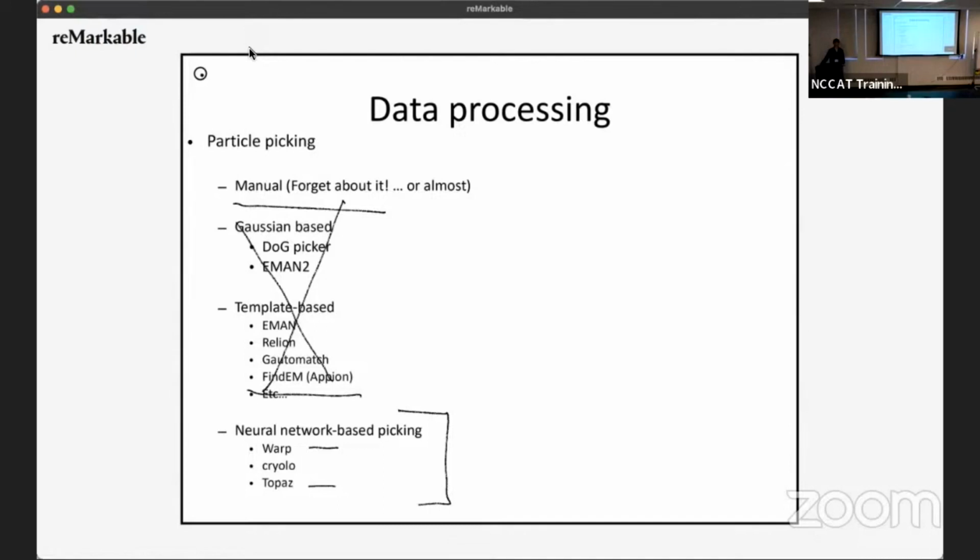Yeah. The problem that I have is that most of these pickers expect basically a circle or a blob, but I have basically a stick. So I have to do manual picking because none of the blob pickers are working for me, and use that to train the tools. Is there a way to get around the manual picking?